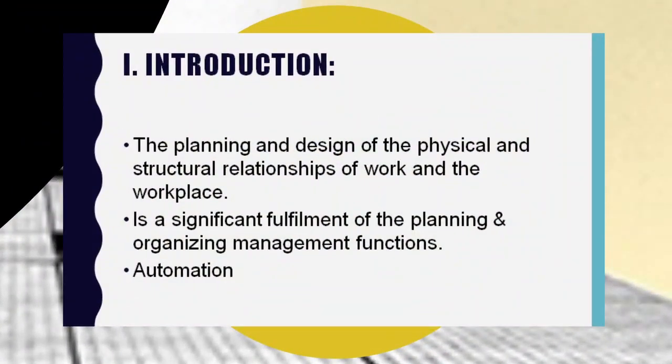To begin this topic, laboratory design is the planning and design of the physical and structural relationships of work and the workplace. It is a significant fulfillment of the planning and organizing management function. The advent of automation and instruments has permitted performance of more procedures in smaller space. It has the greatest influence on laboratory productivity.